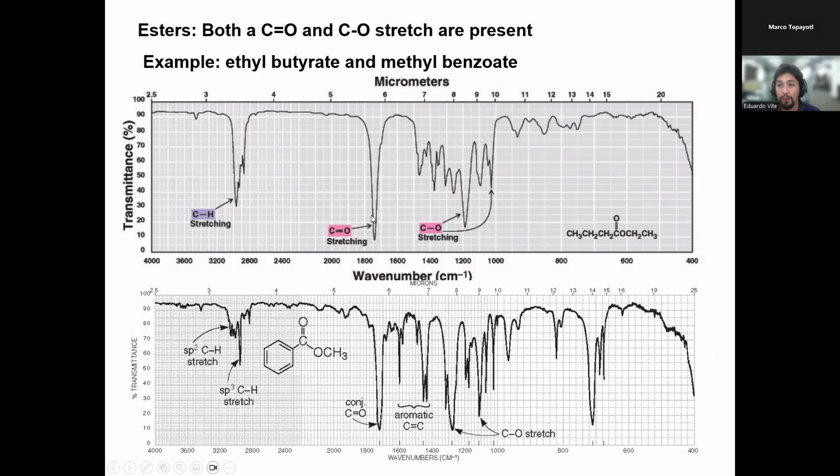Again, note the strong intensity. Only 10% of it got through. 90% of it was absorbed. So you know this is a carbonyl. It is between 1600 and 1800. So in the 1700s, definitely a carbonyl. And if you have that, you also have a CO stretch somewhere else. That could be any one of these peaks, but usually it's the stronger one of the peaks. I don't know about the peak close to 1000. I would personally debate that one, but the one at 1200, definitely a CO.